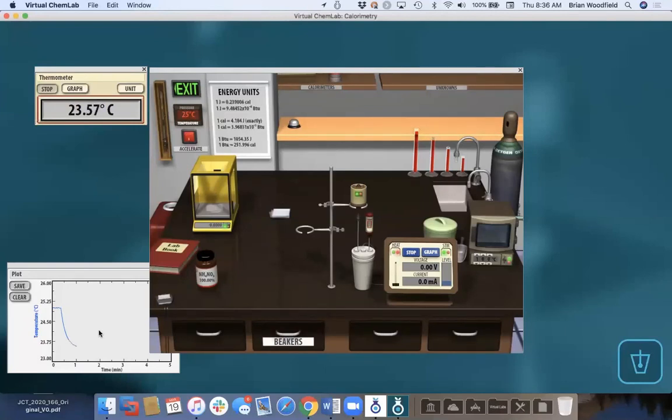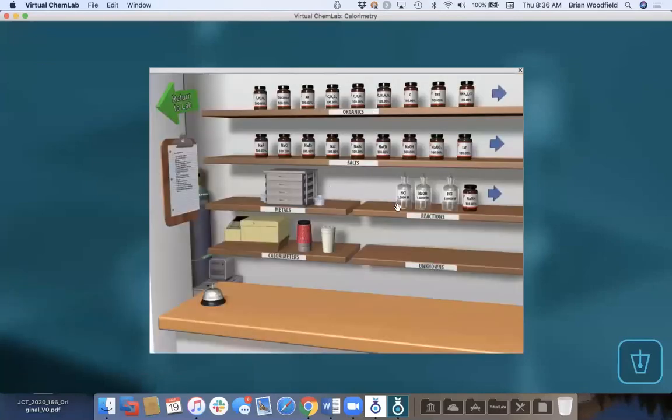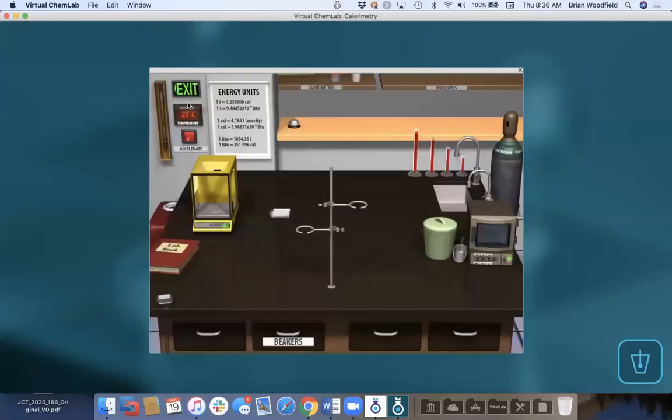We have a great worksheet that talks about enthalpy versus entropy. But for a PChem course, you wouldn't use the preset. You would just say, hey, why don't you build this and design this experiment for how you would do Hess's law. And it's not just these bottles. We have like 100 different bottles, I think, for measuring combustion calorimetry and heats of formation and things like that.